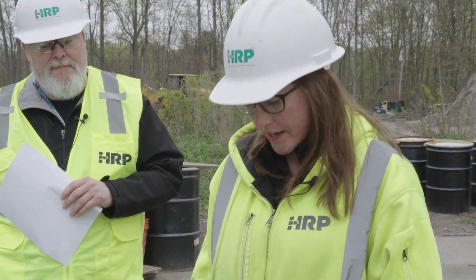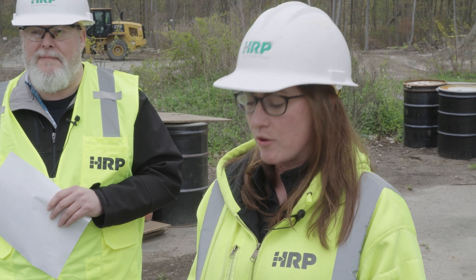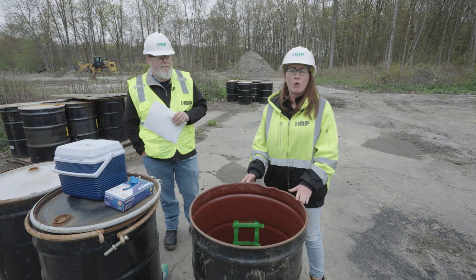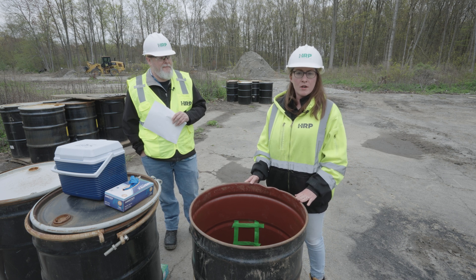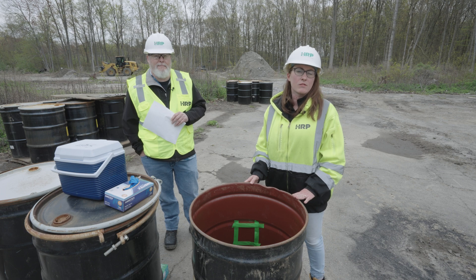The way we originally decontaminated this drum is we rinsed it off with water and collected it into another drum that consisted of PCB wastewater. We then scrubbed it with a water-Alkonox mix. We then took a hexane rag or hexane wipe and wiped down the inside of the drum and let that dry.